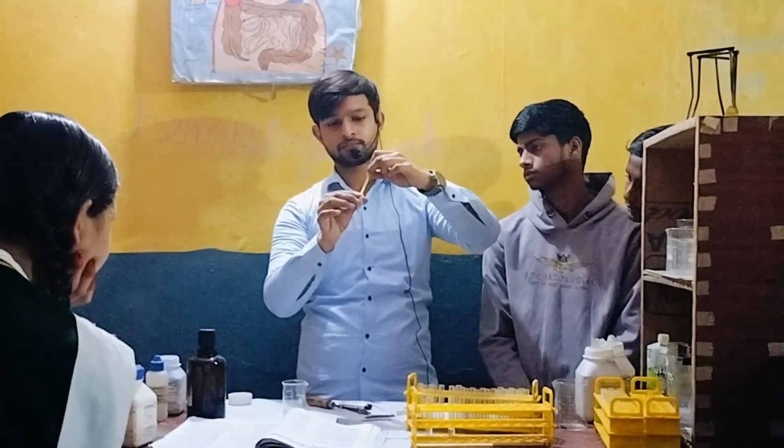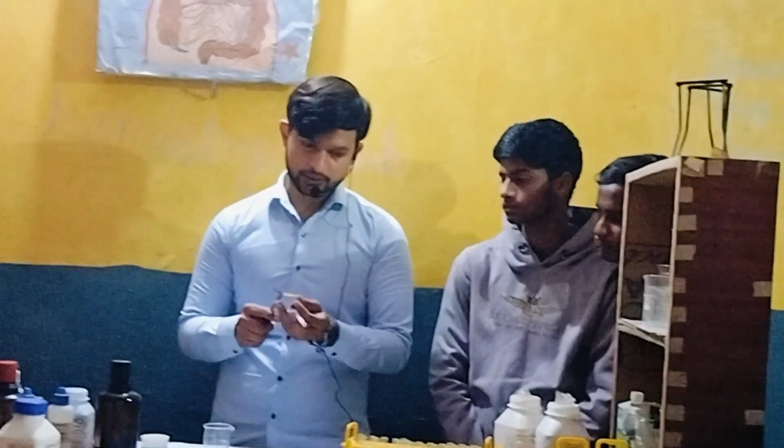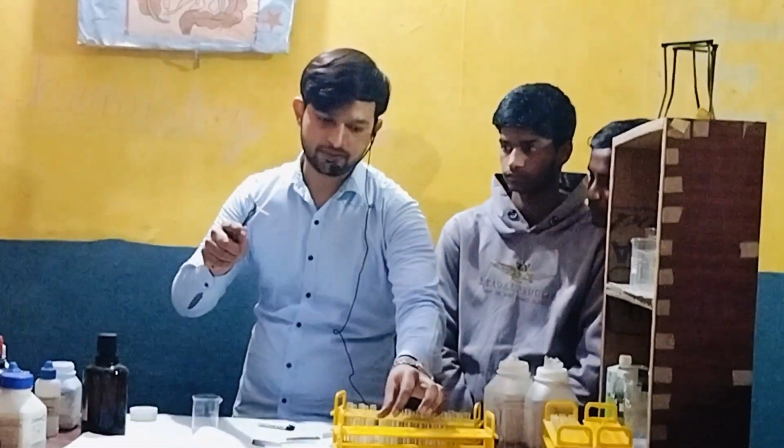Let's see what is this. Oh, the color changed. It means it's acid. What is this? Base. And can you see the color is so dark? So it is strong base. Yes? Okay. See. Nice. Next, put into acid and let's see what will happen.